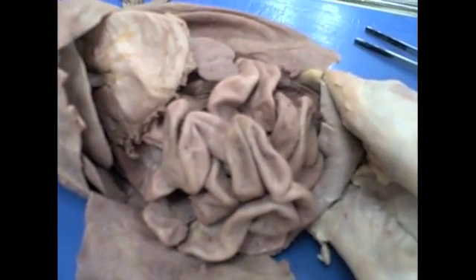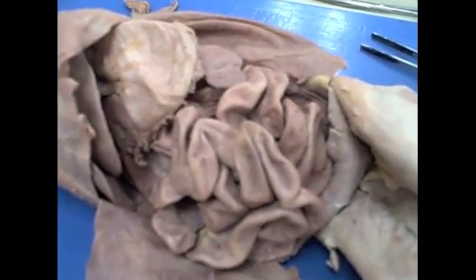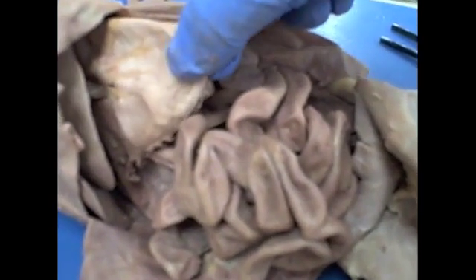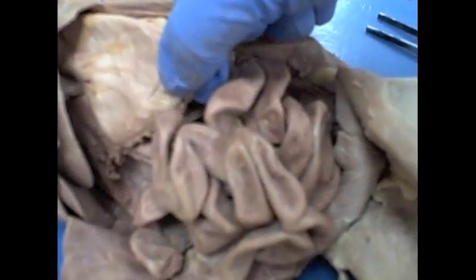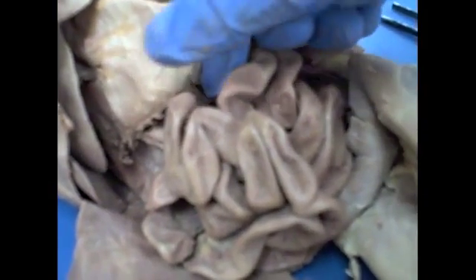We have opened up our cat and we are now looking at the inside. Here is the stomach, which lies on the left side of the upper abdomen and works in digestion. We opened up the stomach and found no worms.